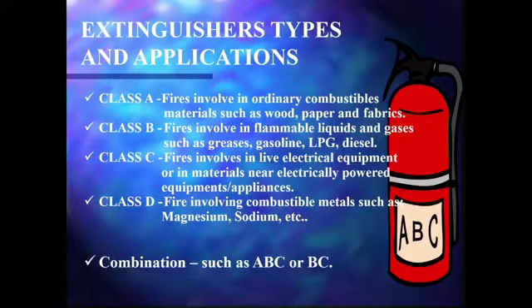Let us talk about the extinguisher types and application. First of all, we need to know the classification of the fires, okay?